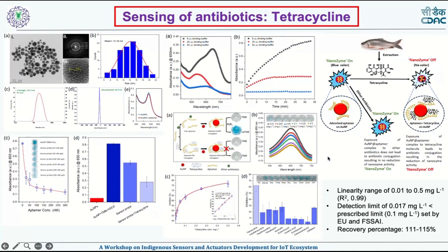And so using this particular reaction mechanism, we can detect the tetracycline residue in water, as well as in fish muscle. This particular work is actually an output of our NSF biosensor project in collaboration with CDAC. Now we can all say that this is all about chemistry.